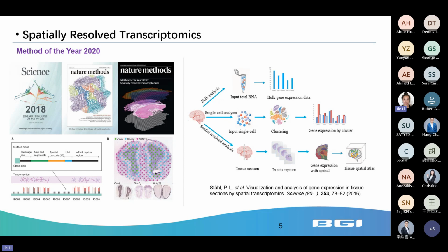So as we know, from the research perspective, our research on the transcriptome can generally go through 3 main stages. First will be the transcriptome study of bulk cells, which could provide the average gene expression level of a large number of cells. While this method plays a significant role in advancing our understanding of the characteristics of cell populations, we could not get information on the specific cells within the population.